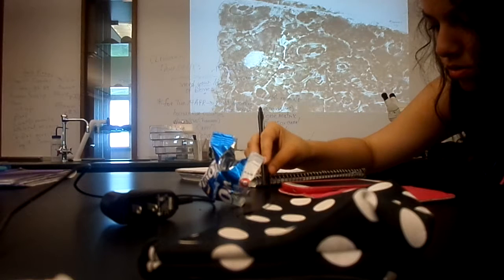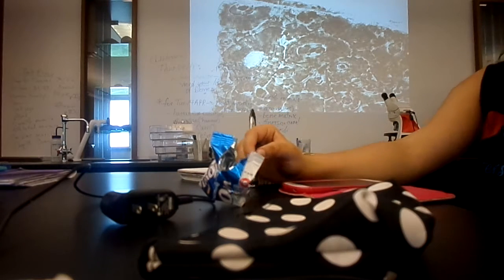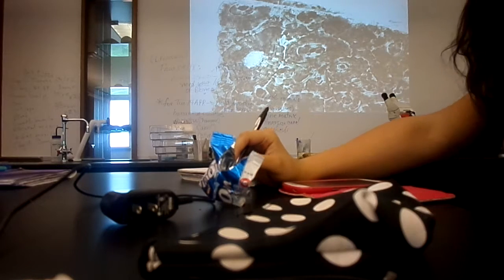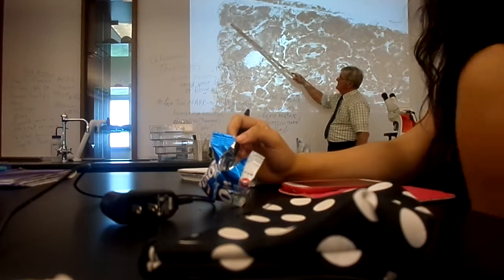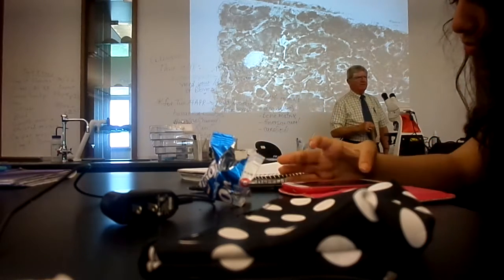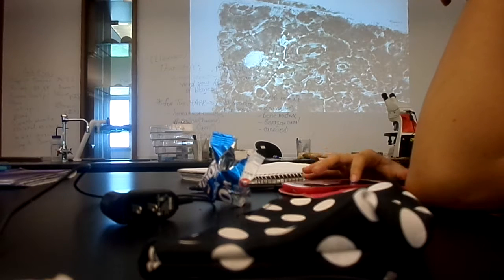Now, I've told you about the haversian canal, so we're down to this last structure called the canaliculi. Now, there's not one of them, that's the plural form of the word. All of these, what look like black lines on this diagram, or if you look up here, you can see the canaliculi pretty easily there, as well as elsewhere. Here's some. These are grooves in the bone matrix, where part of the bone cell was lying. So over on this chart, and this is very helpful, I think.